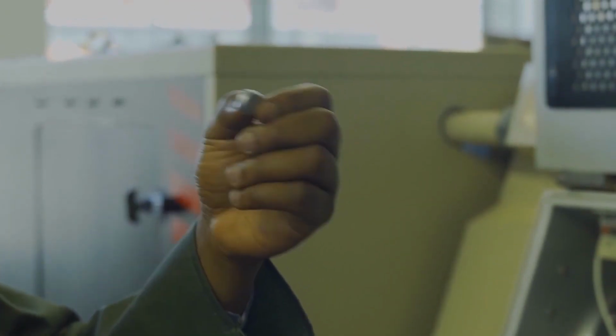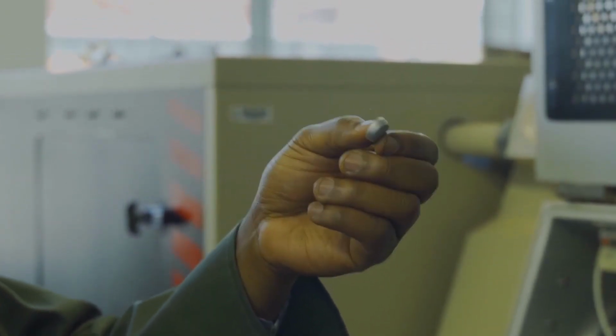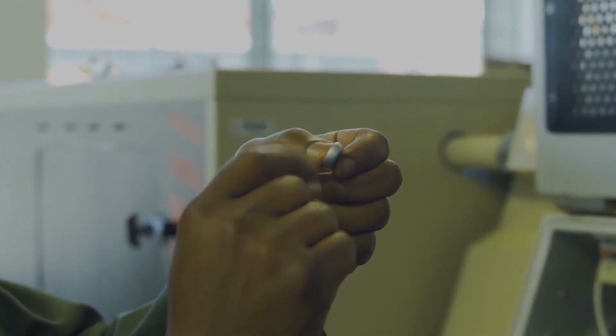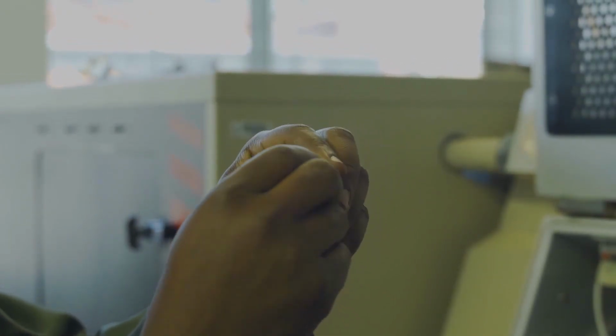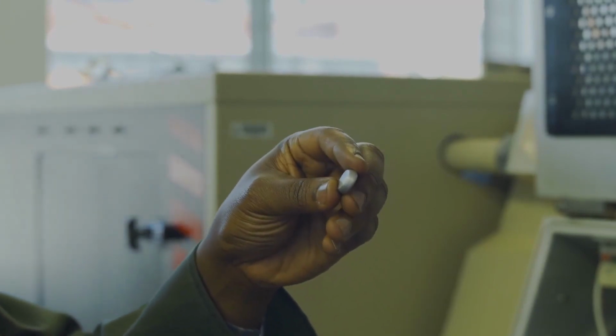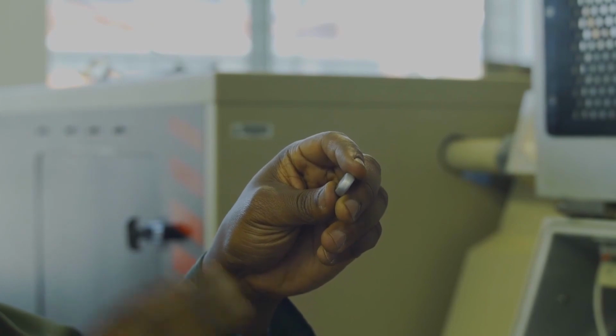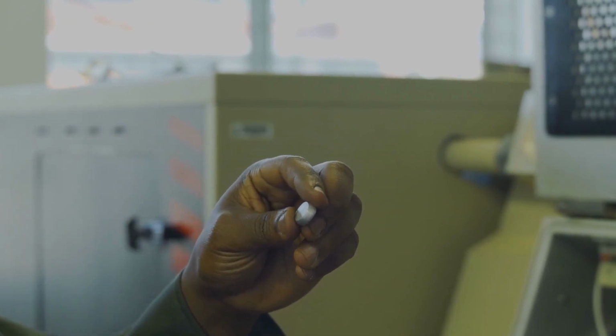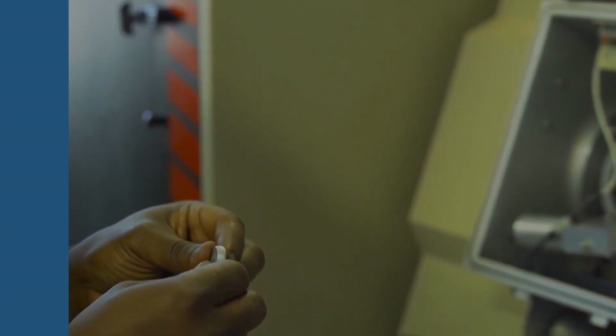For every sample, you need to calculate the barreling coefficient, and that requires you measuring the diameter of this deformed sample, and of course, the final height. So the instruction on how to do that will be found in the Gleeble application notes. But how you can do a quick check on the computer, that's the next thing that I'm going to show you.